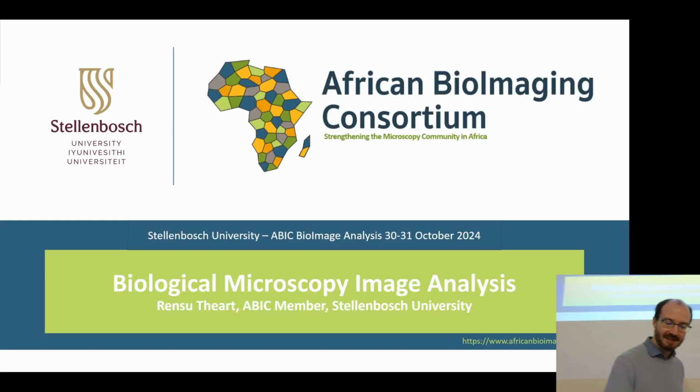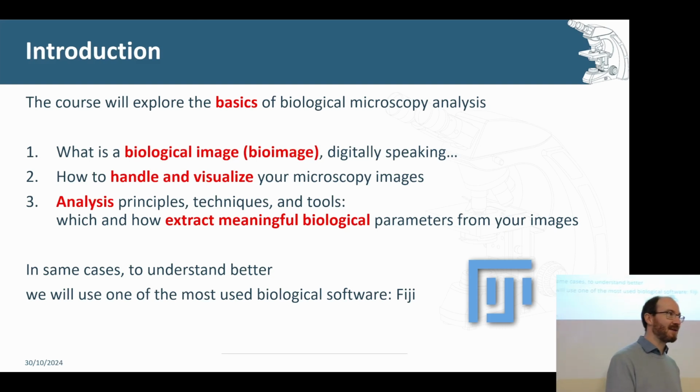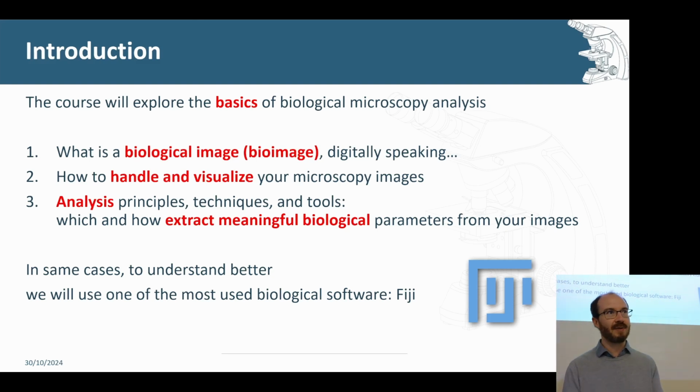Great. So just to maybe give a little bit of an overview of things here. This course explores the basics of biological microscopy analysis, and we will start by looking at, first of all, what is an image, what is a bioimage, and then just the concepts around that, like just what you need to know about where an image comes from, what is actually stored there, how do we actually work with these intensity values, etc. And then from that we will say, cool, now that we understand how these intensity values are put together, how can we visualize this in a way that is helpful for our analysis?